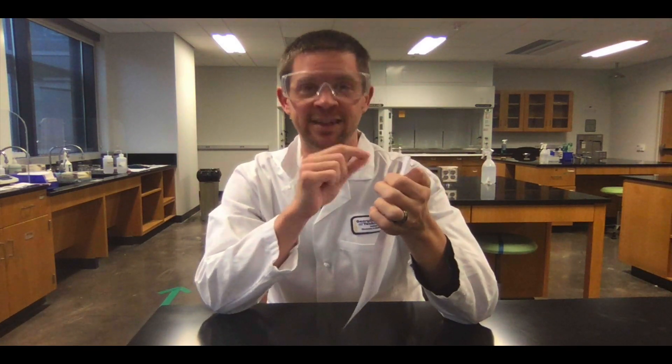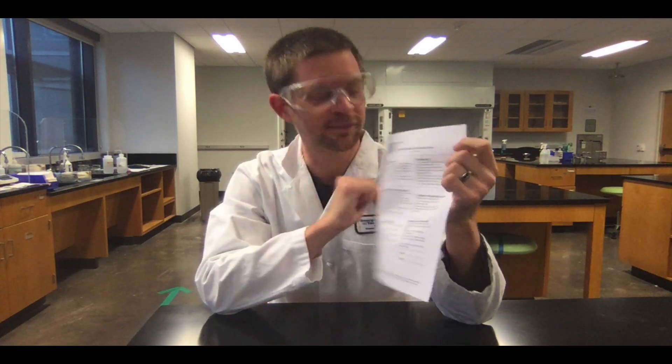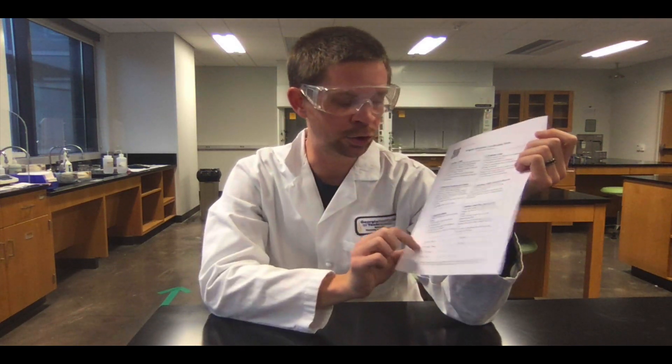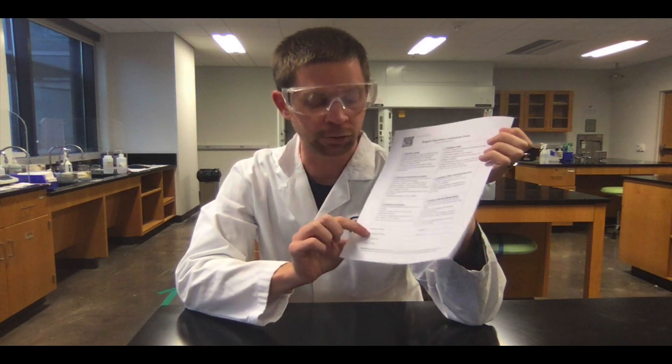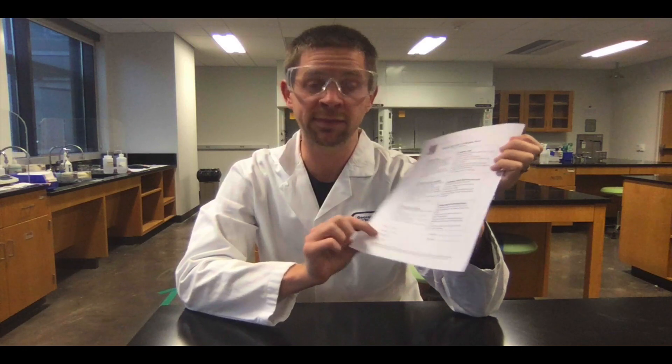Once the operation's done, as you're doing it the observer should be checking off the boxes that everything was done according to specifications. Once that's done, you'll add your name at the bottom and your signature. Your lab partner or observer will add their name and signature at the bottom to verify that they've observed faithfully. Then you'll take the form to your TA and they will sign to verify that the interaction actually took place. You'll add today's date, and that helps us know which experiment this corresponds to.